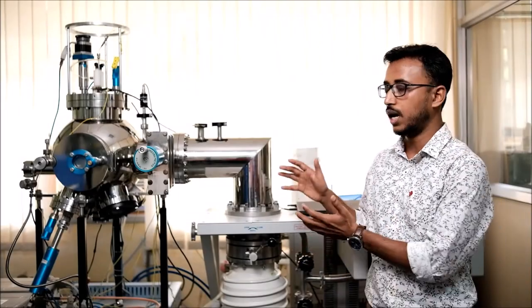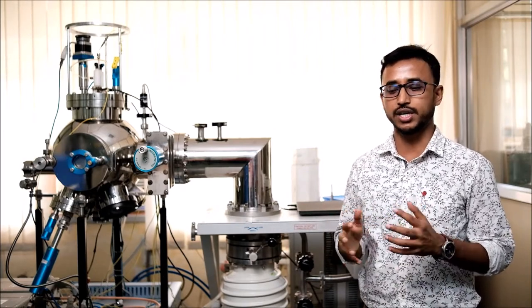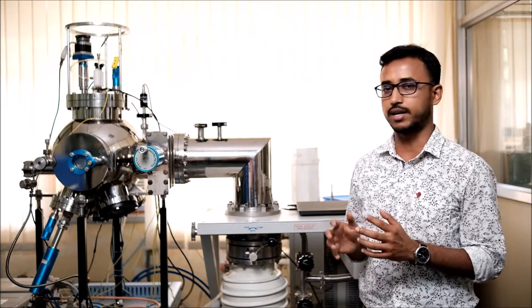Hi, myself Krishna Rudrapal, a research scholar working under Dr. Oyanra Choudhury at the Material Science Center of IIT Kharagpur. This is the Functional Nanomaterials and Thin Film Lab. Here we work on thin film based devices in the applications of opto, electro, memory, and sensing devices. I am in front of the RF sputtering system and through this video I am going to demonstrate the operation of the sputtering system.